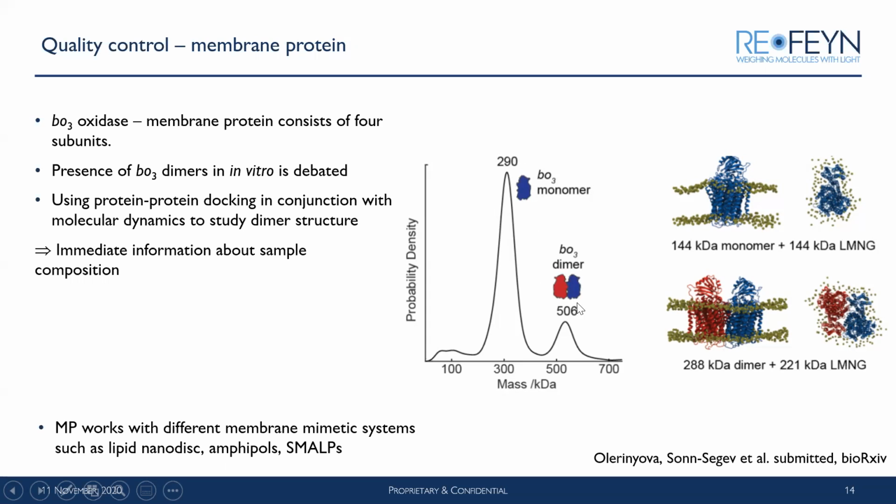And the reason for that is because when you have a membrane protein which dimerizes, the interface to the detergent decreases, and that's why you have a smaller detergent belt. And you can do some calculations, and this is what we did in this paper, basically showing that the amount of detergent belt that we measure correlates with what we expect.